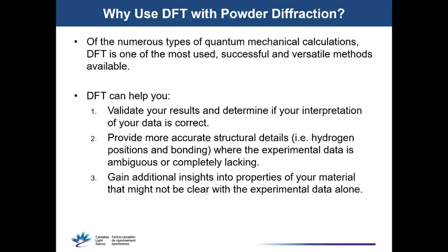For instance, X-rays do not see hydrogen very well. So DFT is very complementary with your Rietveld refinement to determine accurate hydrogen bonding and hydrogen positions in organics and metal organics, systems like that. And DFT can also potentially give you some insight into properties of your material as well.